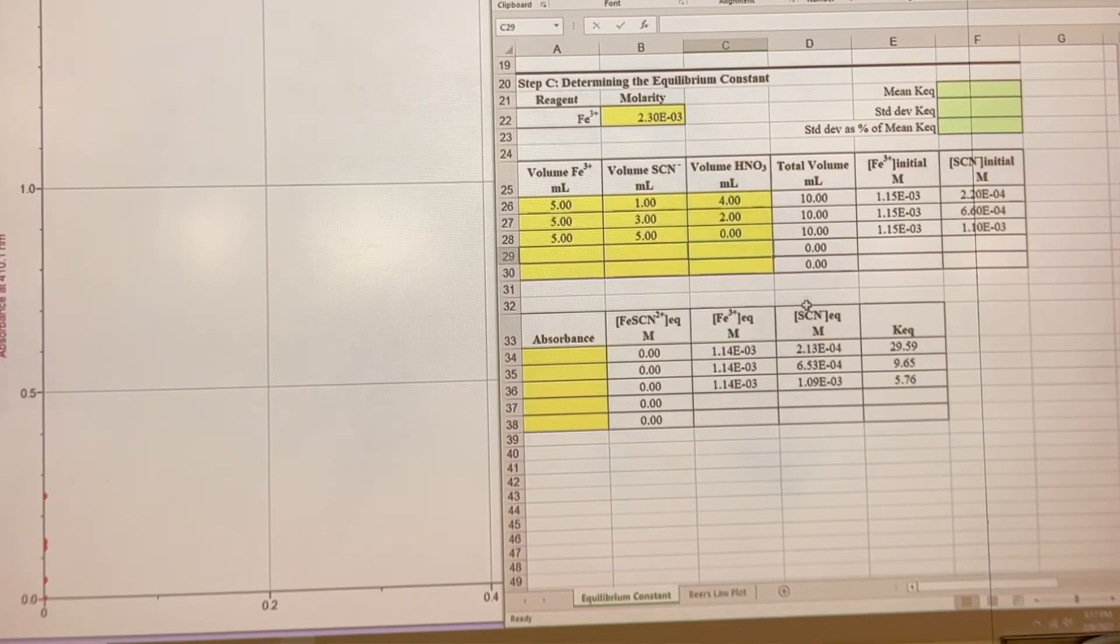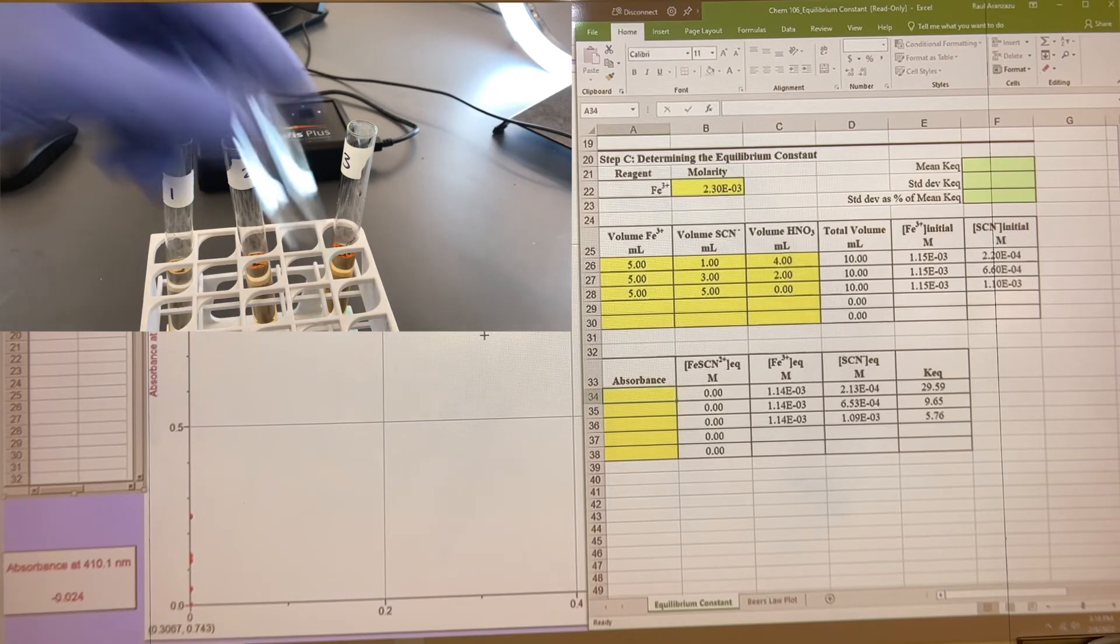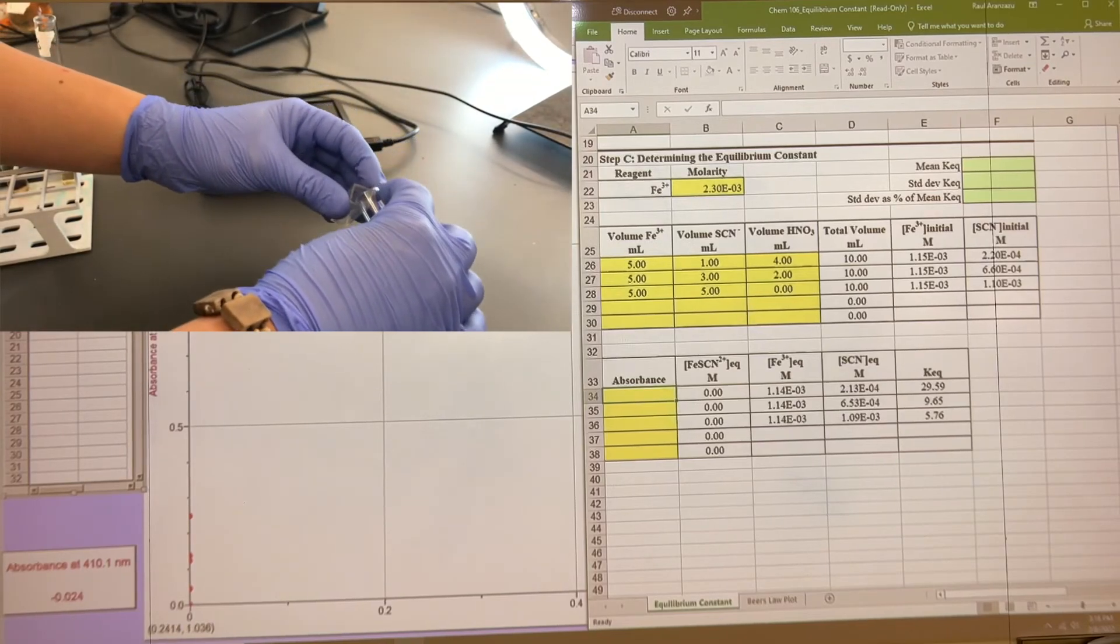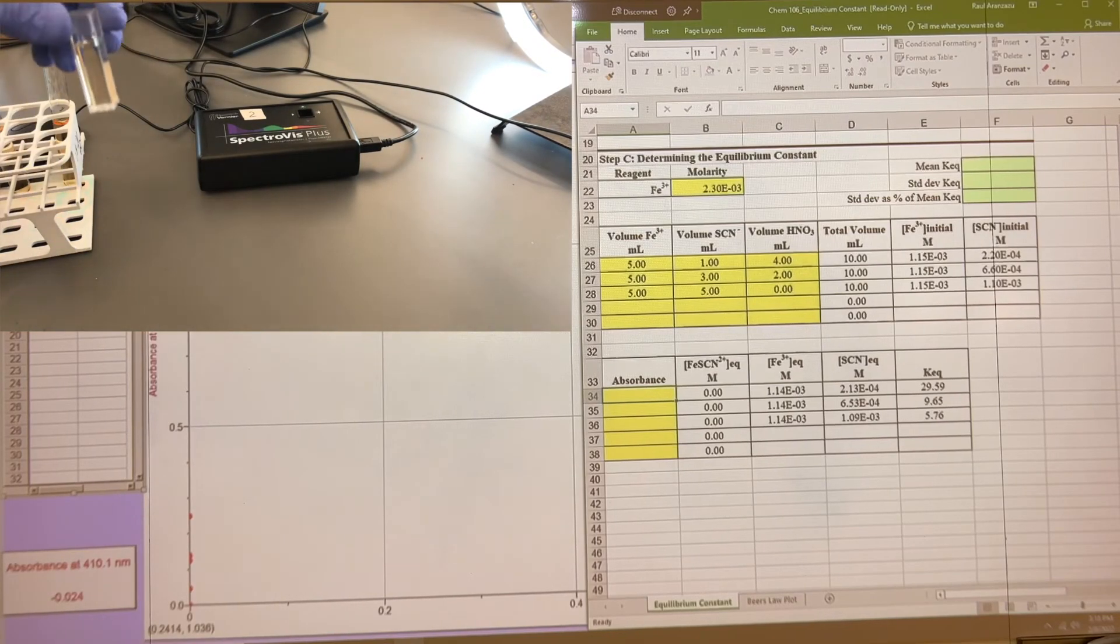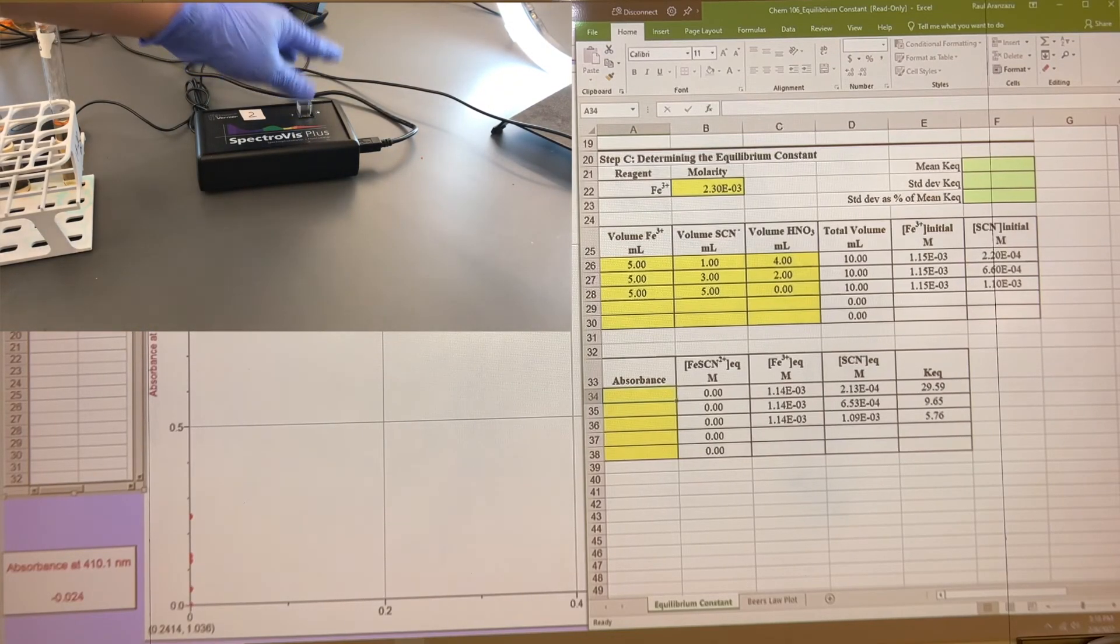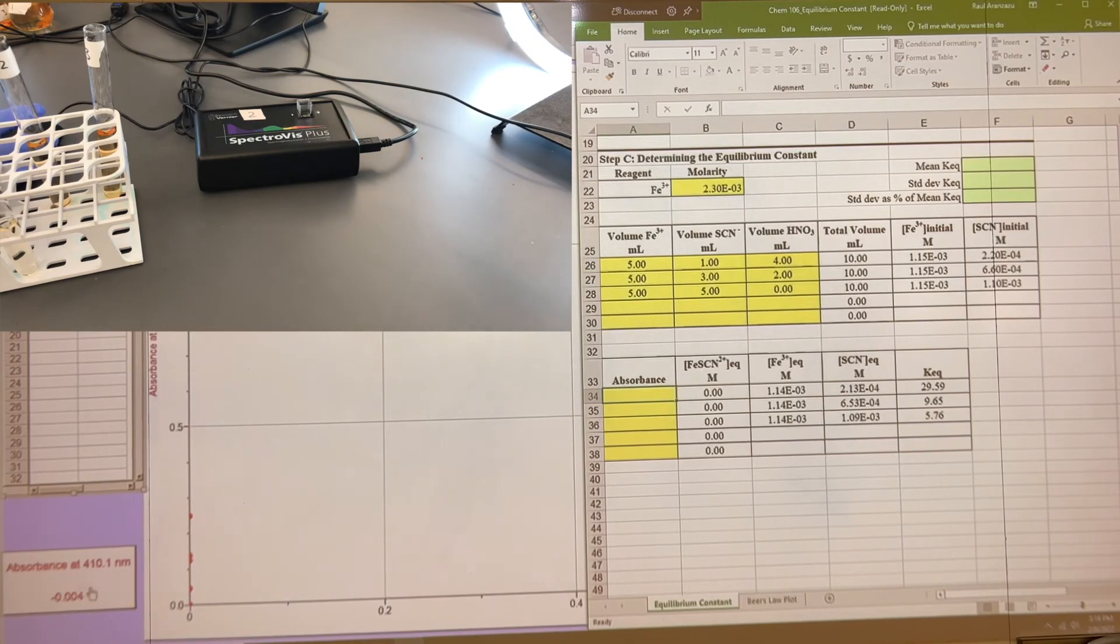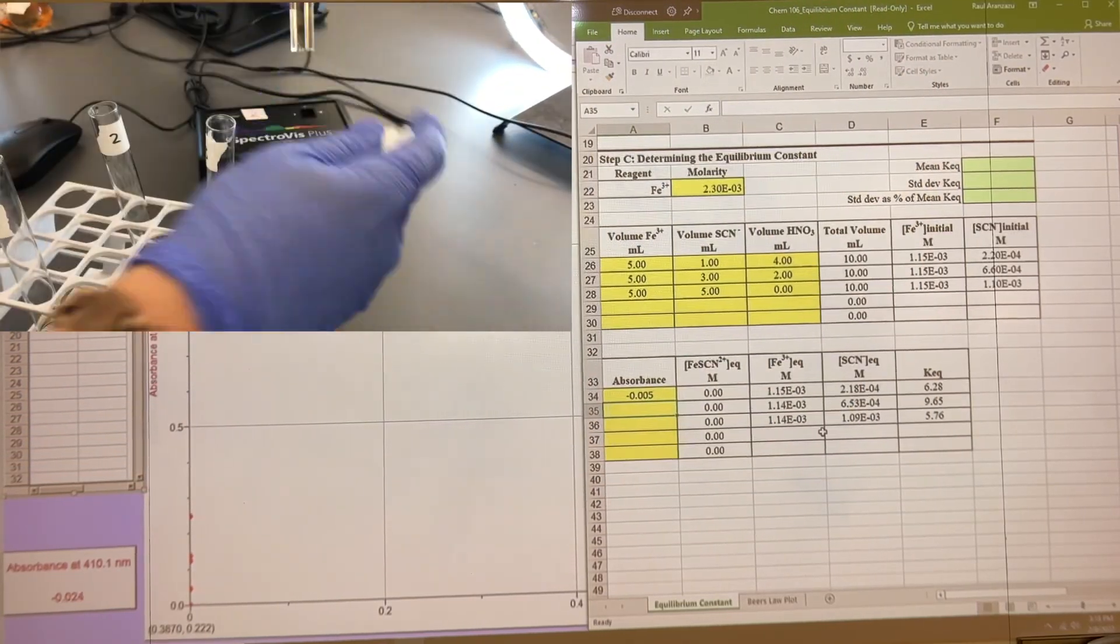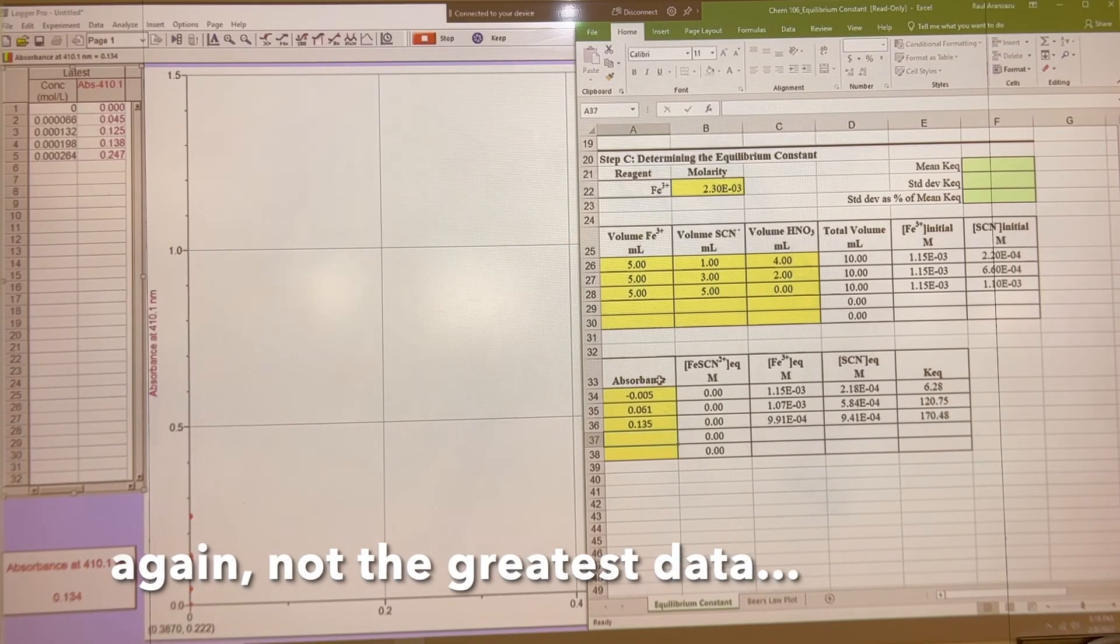For this one, all we really need are just the absorbance values. So, all we're going to do is clean cuvette, take our number one, pour in a little bit here. Back on the rack. Get a kim wipe. Clean it off. Into the spec. And then, all we're looking for is just down here, our absorbance value for these.